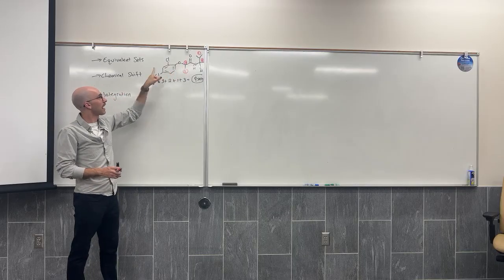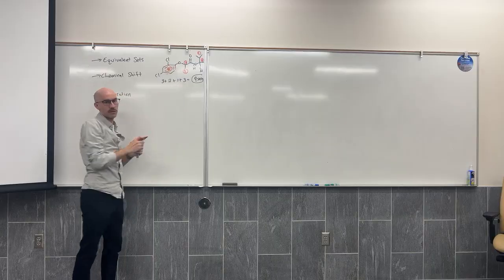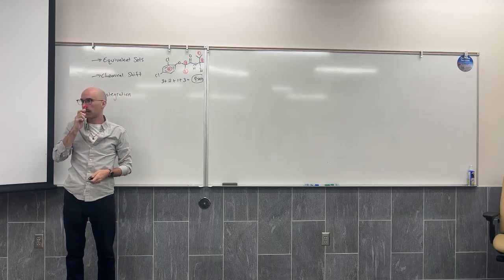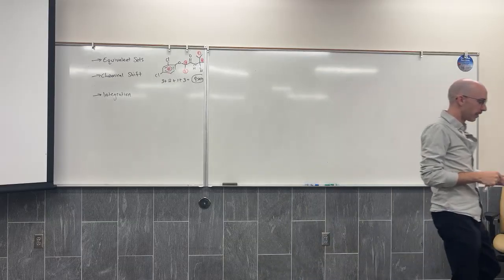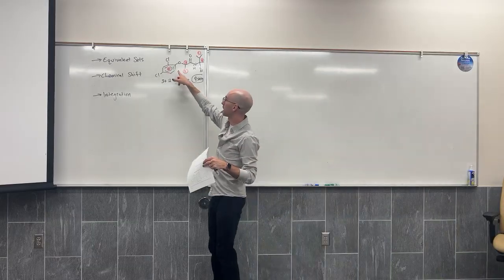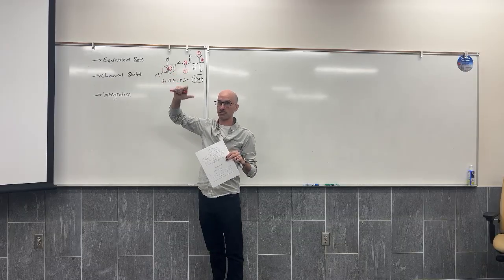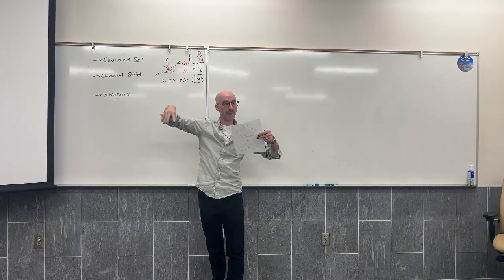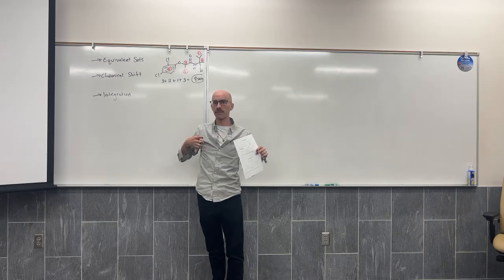is no alkene in the molecule, because it has that compounding effect by being functional group adjacent twice. And then we have the aromatic region, and I'm just going to call the aromatic region 4 because the aromatic region all just kind of shows up within itself, and I am not going to expect you to predict which of these signals is furthest to the left. It actually gets really complicated how the aromatic ring shields and de-shields when it has other groups on it.